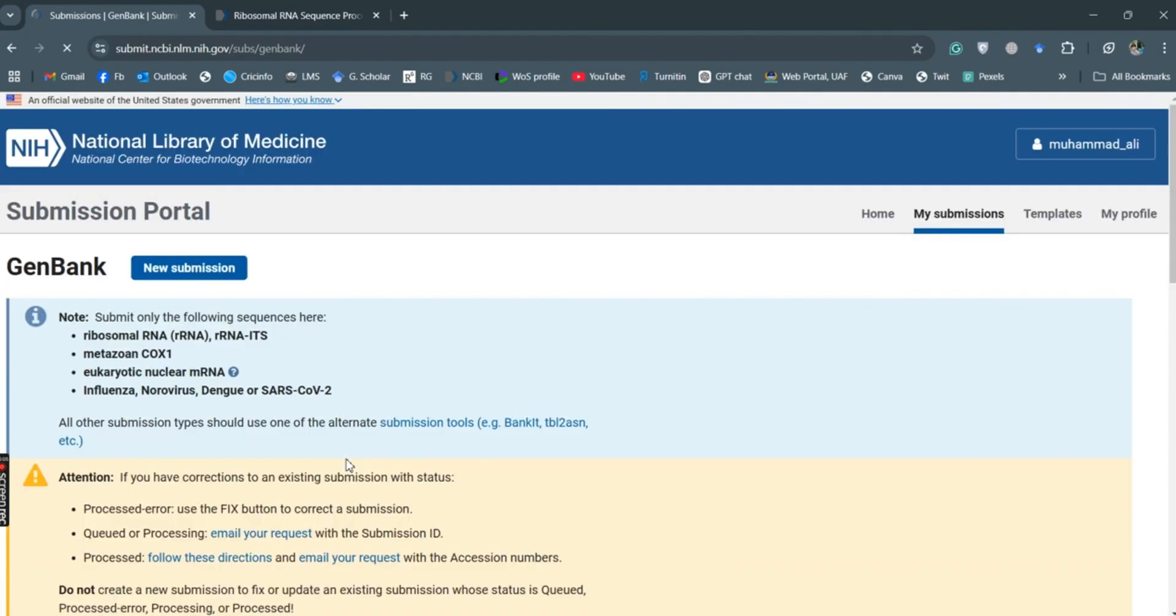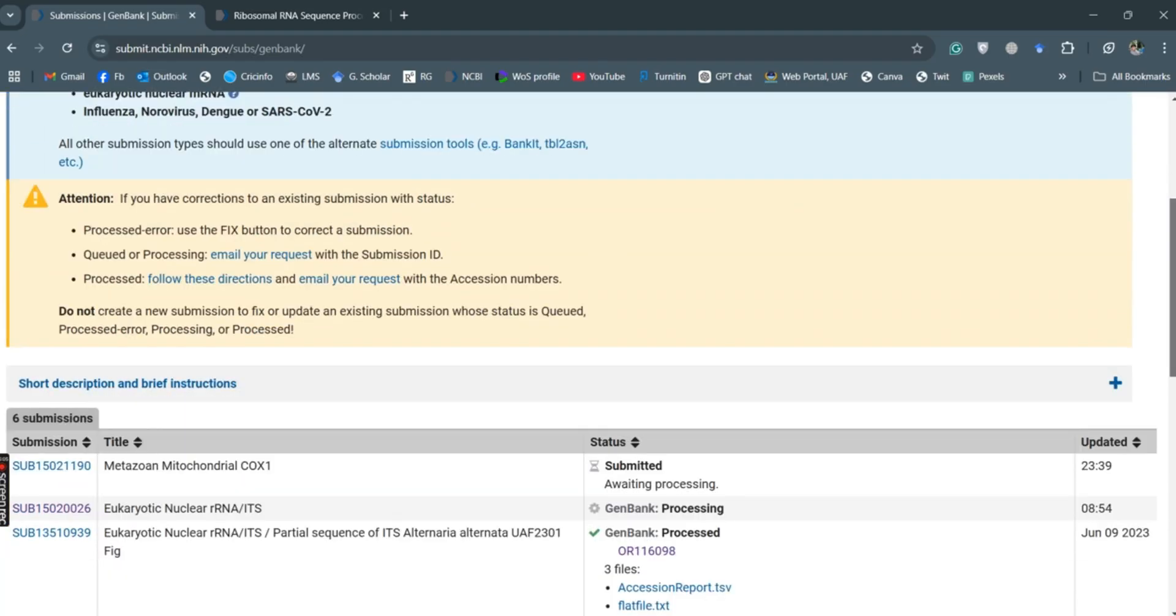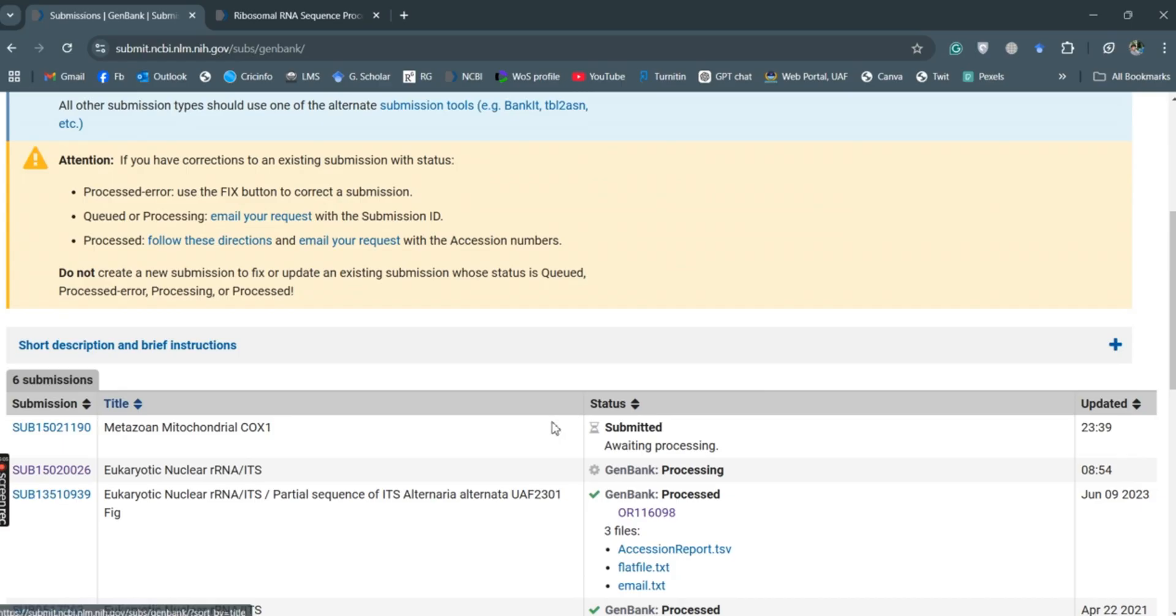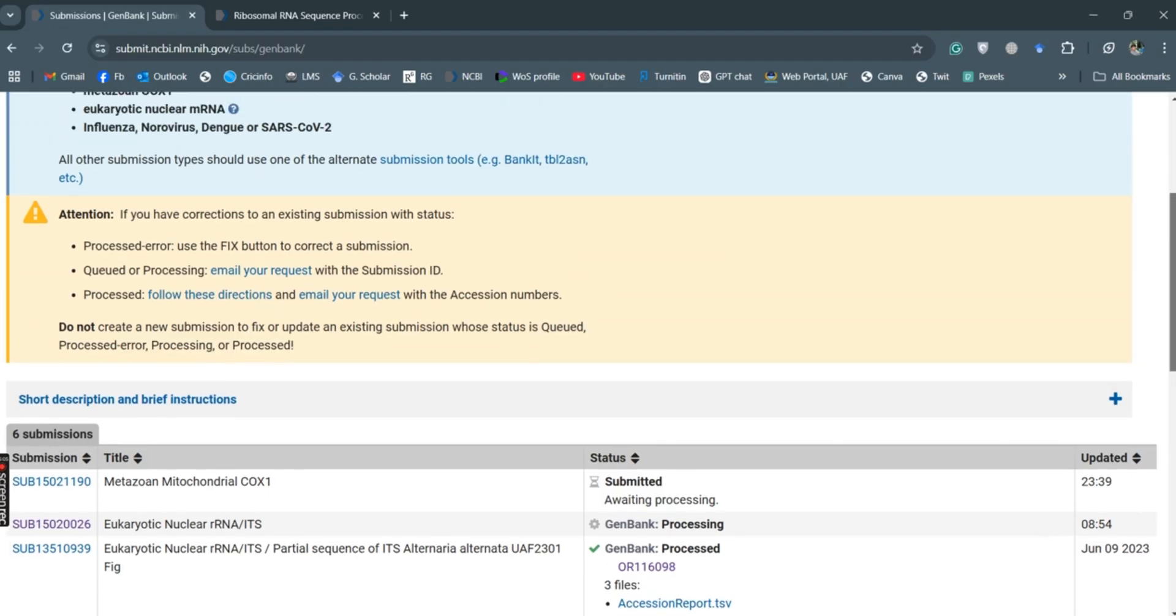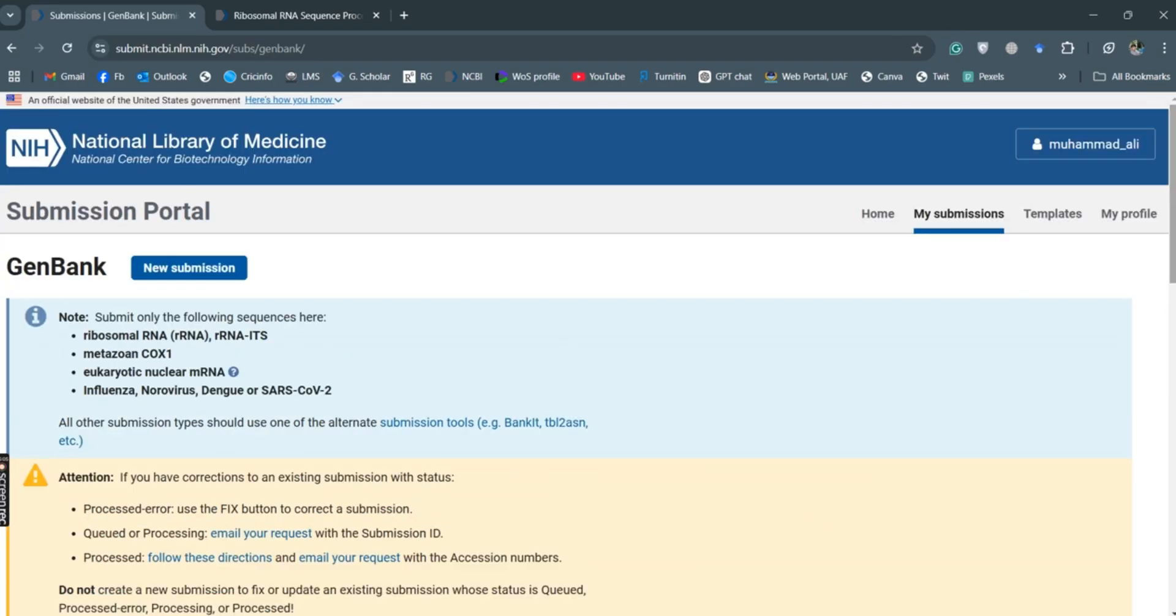So this is all about the submission of the COX sequences to the NCBI GenBank database. So here as you can see, mitochondrial COX1 sequence, and this is submitted. This is the most recent submission we have made for the COX1 genes. That was all about this video. I hope you like it. Thank you very much.